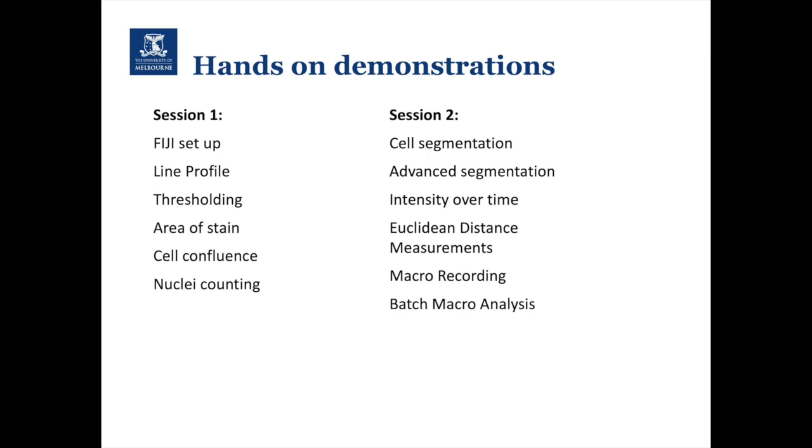In session 1 of the FIJI for Quantification workshop, we will cover demonstrations on FIJI setup, line profile, thresholding, area of stain, cell confluence, and nuclei counting.